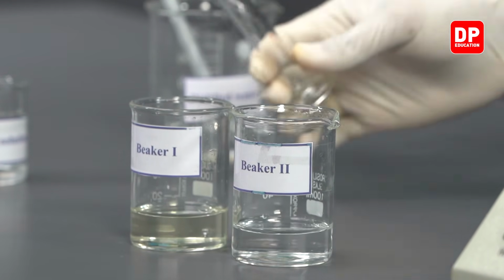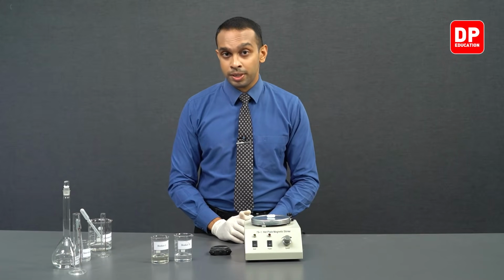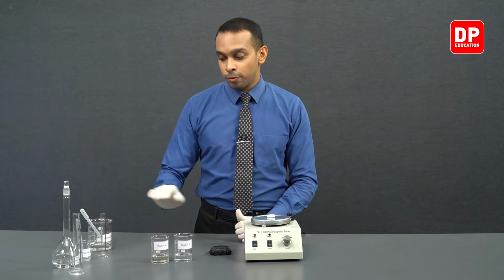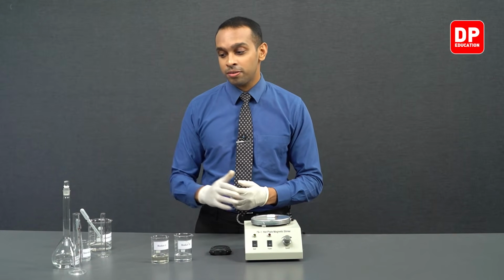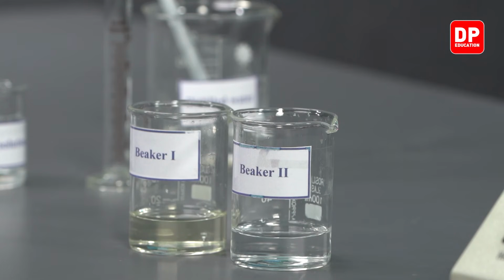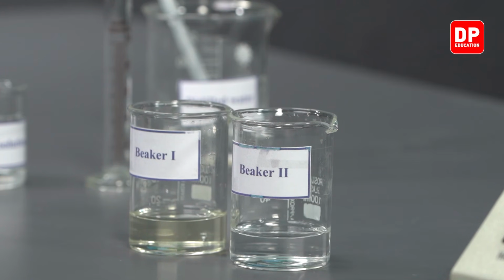Now beaker 2 initially contained only 4 cubic centimeters of potassium iodide solution. After addition of 6 milliliters of distilled water, it came up to 10 cubic centimeters, and after addition of our sodium thiosulfate solution, it came up to 25 cubic centimeters. So when we mix these two solutions together, the total volume would be 50 cubic centimeters.